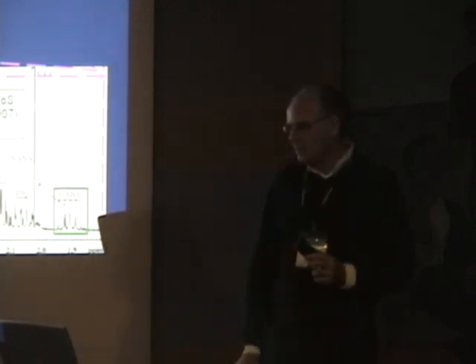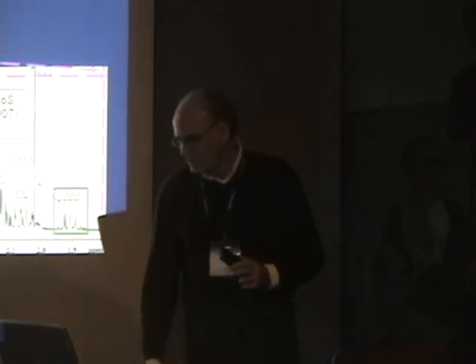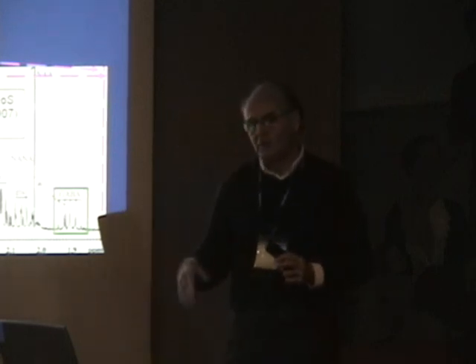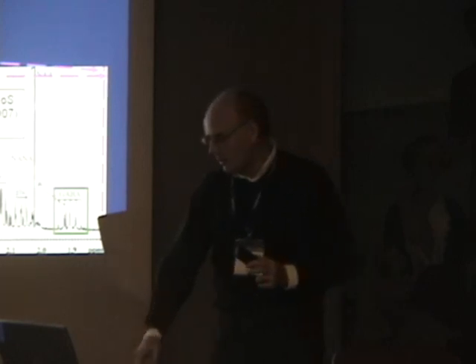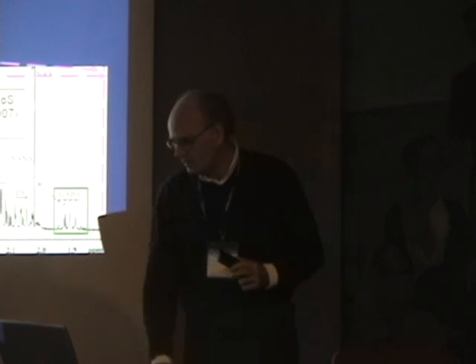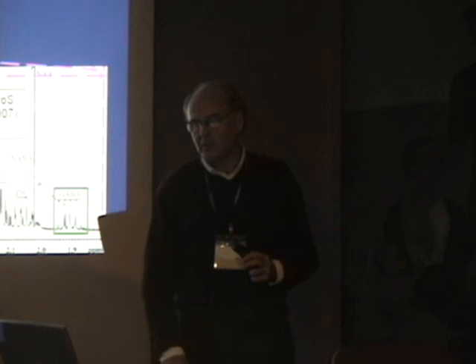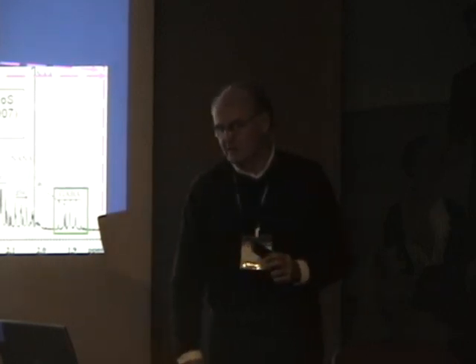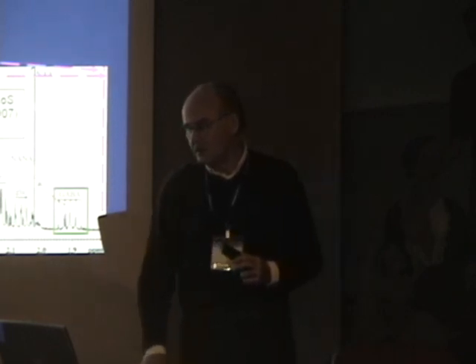Here, this is the same spectral region, the red box, with a lot more information. Peaks that go all the way down, mostly to the baseline, that are very narrow. And I have shown you, if you attended my presentation downstairs, even more details, especially in this glutamate peak that you see here in the middle of this red box. So that's an extremely high resolution that, of course, you get only if you do a very careful and optimized procedure, starting from extracting the tissue all the way through spectroscopy and the evaluation of the spectrum.